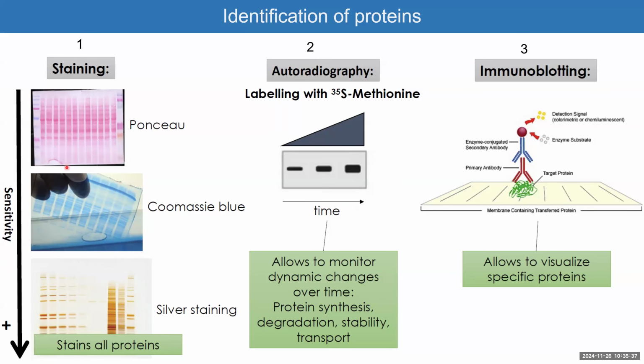So what I was saying is that the Coomassie blue or the silver stain are PAGEs, and all you do is just that last step where you take a membrane similar size to the PAGE gel, and you put it side by side to that membrane, and you put paper around the membrane and the gel, and you apply electric current so that the proteins that are embedded within the gel, let's take this as an example, will migrate out of that gel, and since the membrane is not allowing the protein to pass, they will stick to the membrane.